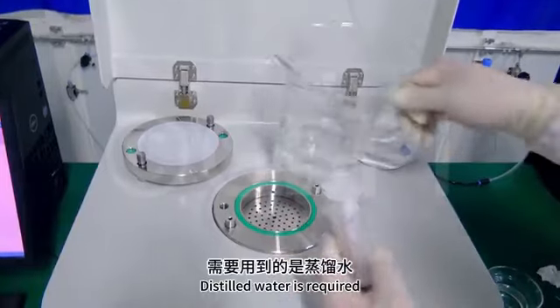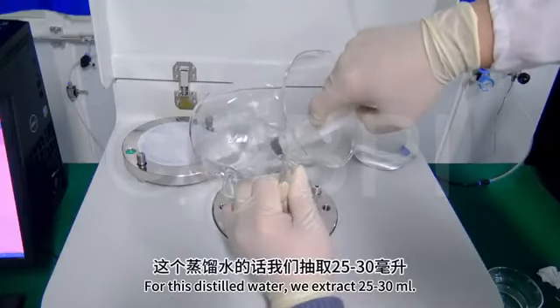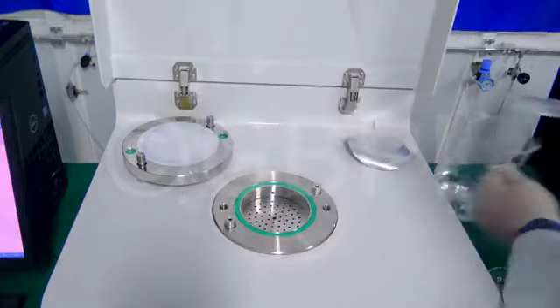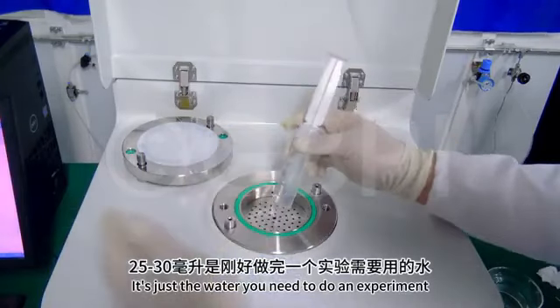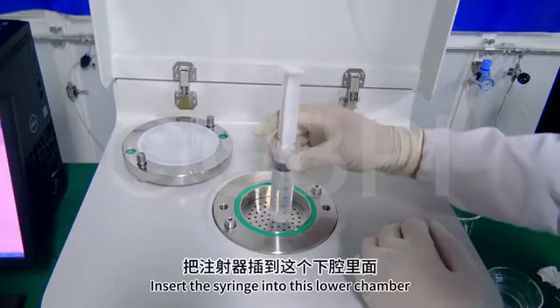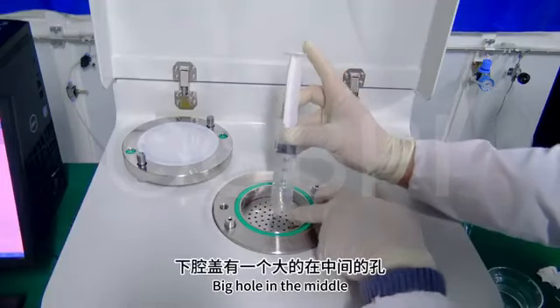Distilled water is required. For this distilled water, we extract 25 to 30 mL. It's just the water you need to do an experiment. Insert the syringe into this lower chamber. There is one in the lower cavity cover. Big hole in the middle.